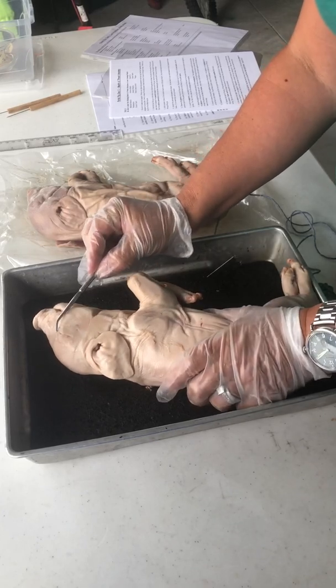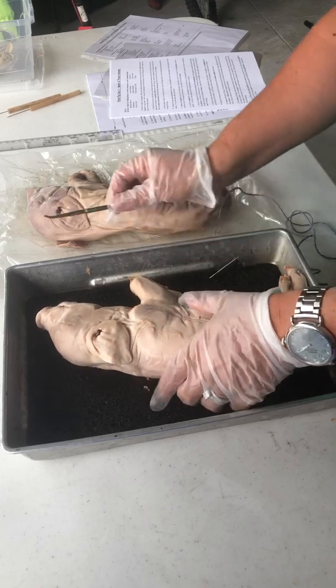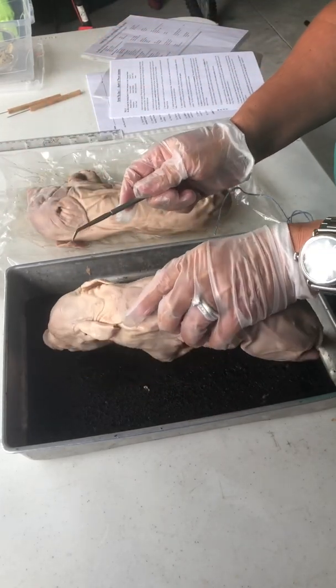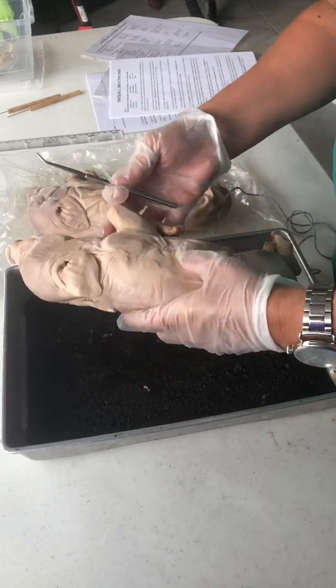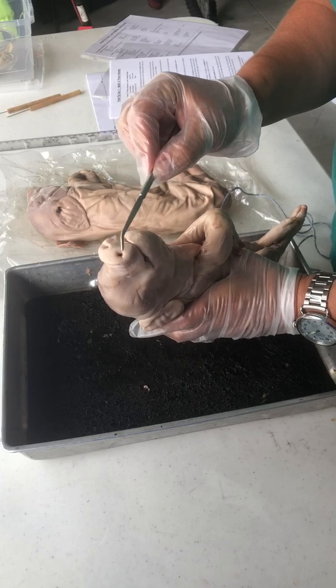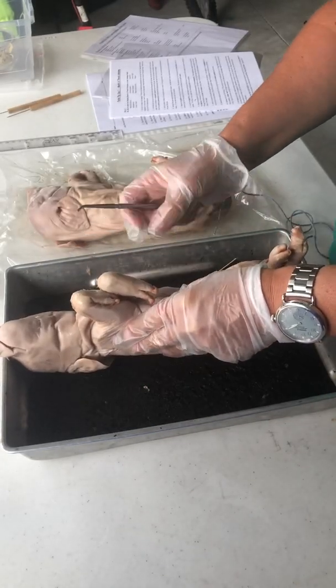So next we're going to examine the head, and you're going to locate the eyelids. Here you have the eyelids right here. They protect the eyeballs from debris. And then you have the external ears, which are the pinnae, which is right here. They help the pig hear. And then the external nostrils, which are right here. The official name for these are the nares. And then you're going to study the pig's appendages, examine the pig's toes.